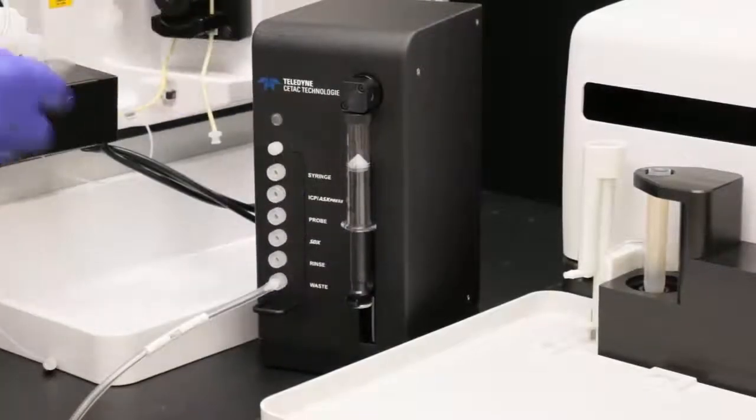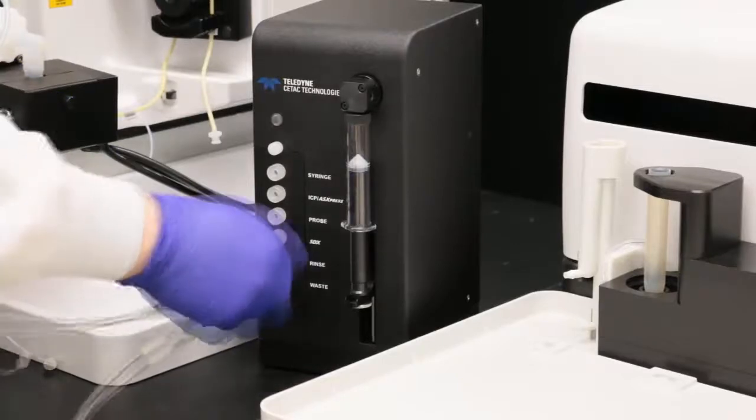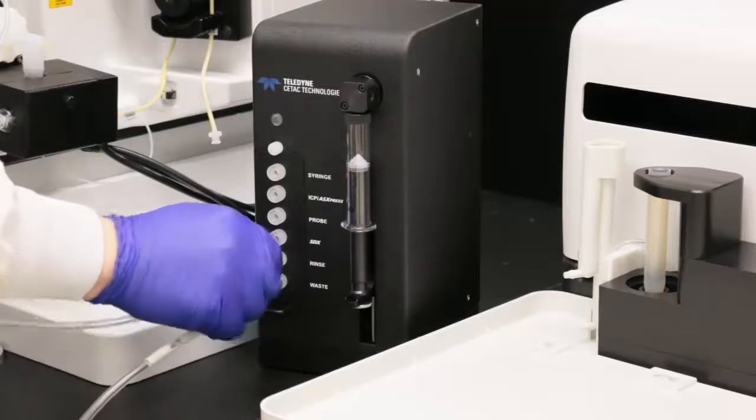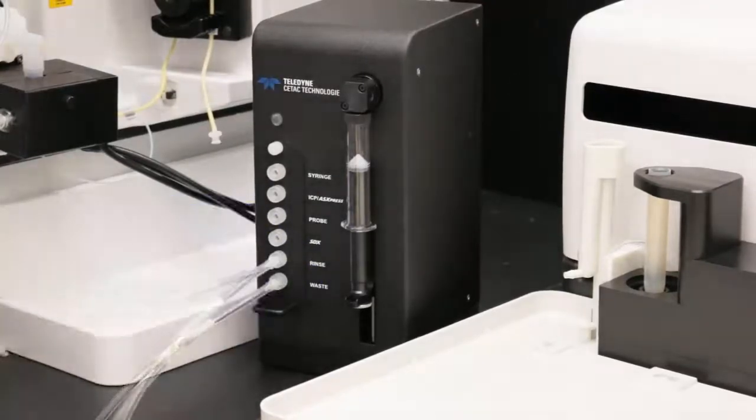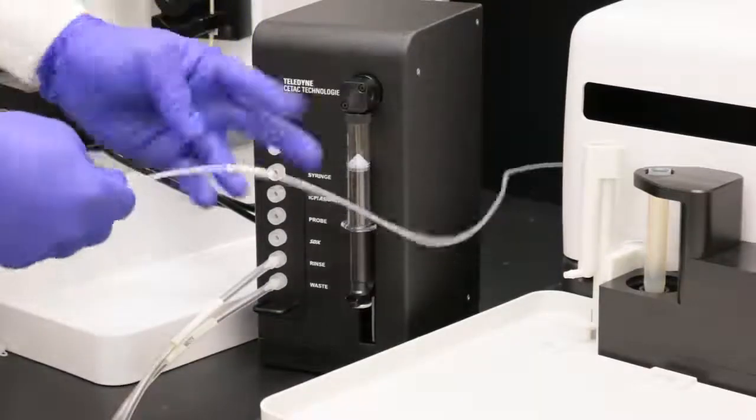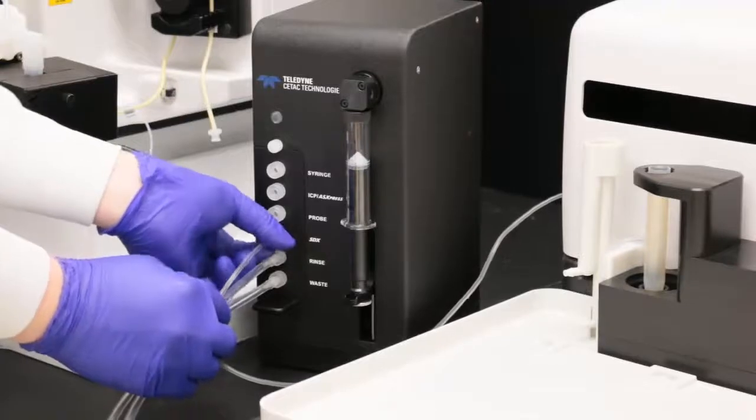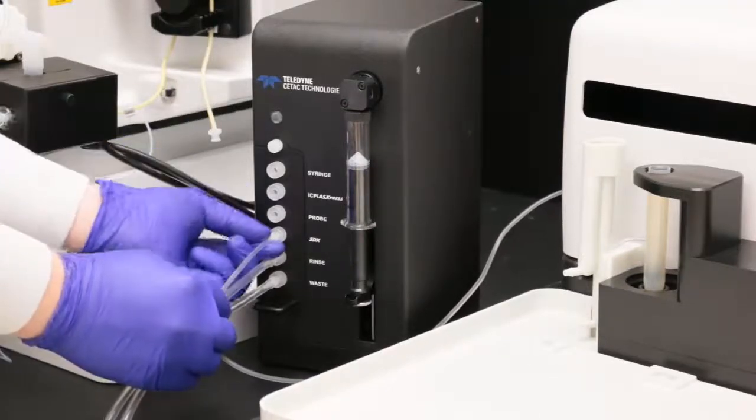Locate the rinse tube. Connect the rinse tube to the rinse connector. Place the other end of the rinse tube in the bottle of Vortex Vessel Rinse Solution. Connect the Vortex to SDX tube to the SDX port. This is the tube connected from the bottom of the Vortex Vessel.